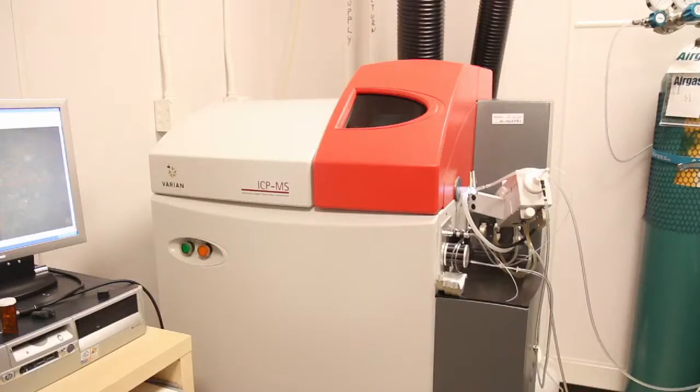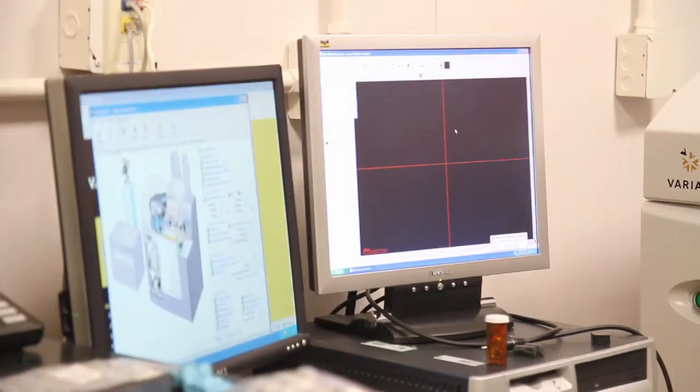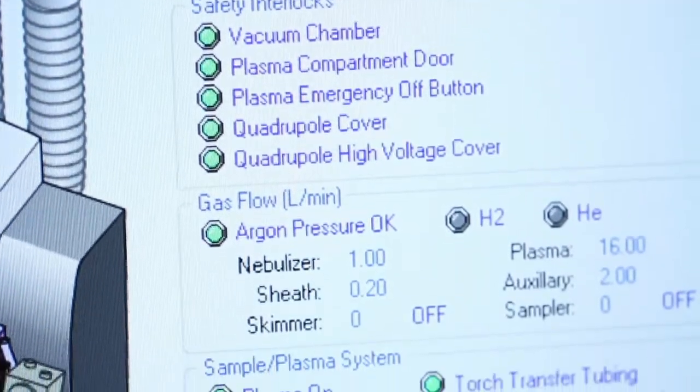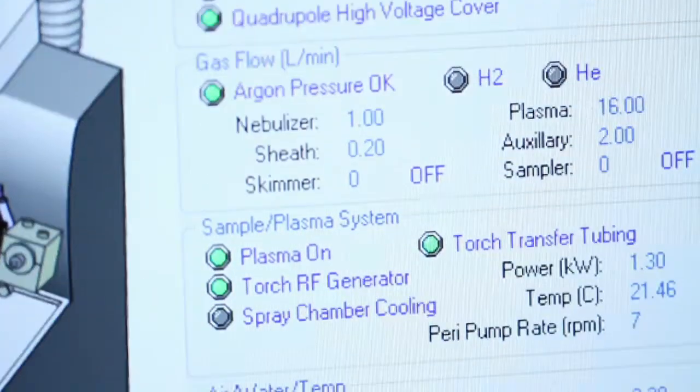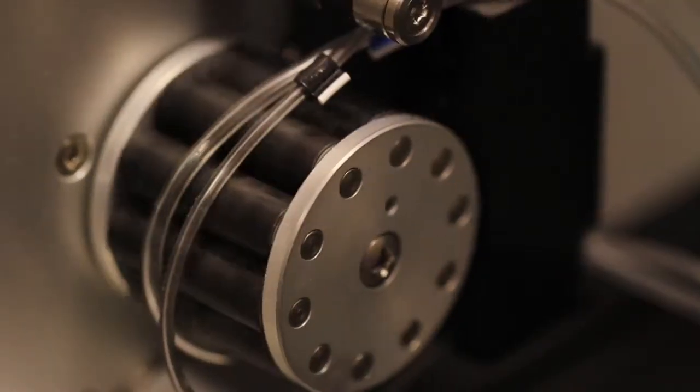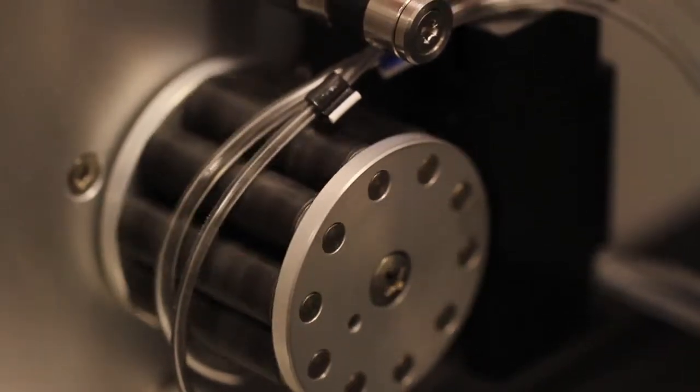There is the ICP-MS, which is an instrument we use to measure the composition of the object we want to study. We have a laser and you need to put the sample, the object, into a chamber. This chamber will limit the size of your object — it is a cylinder that has a diameter of six centimeters and is five centimeters deep.